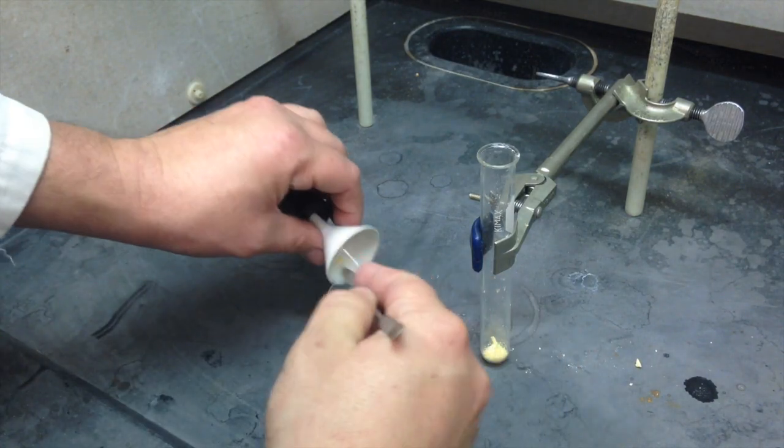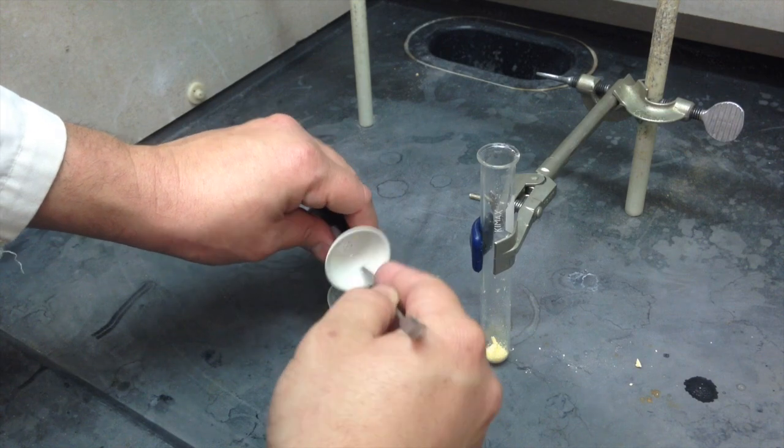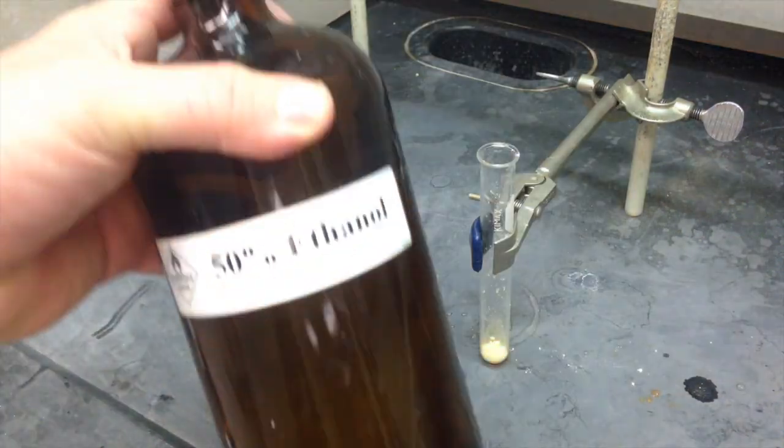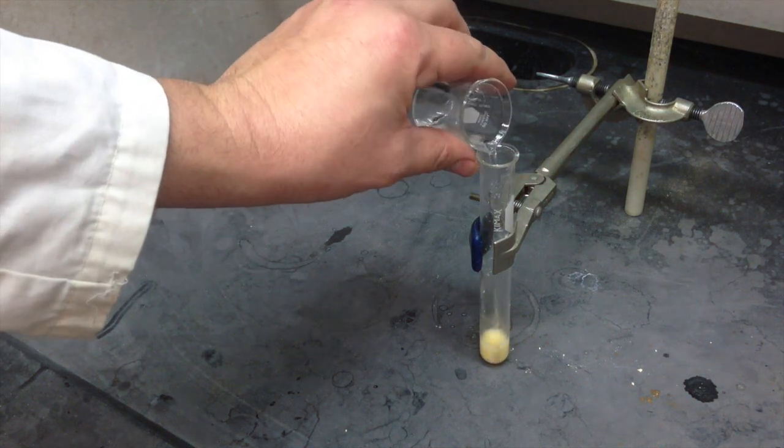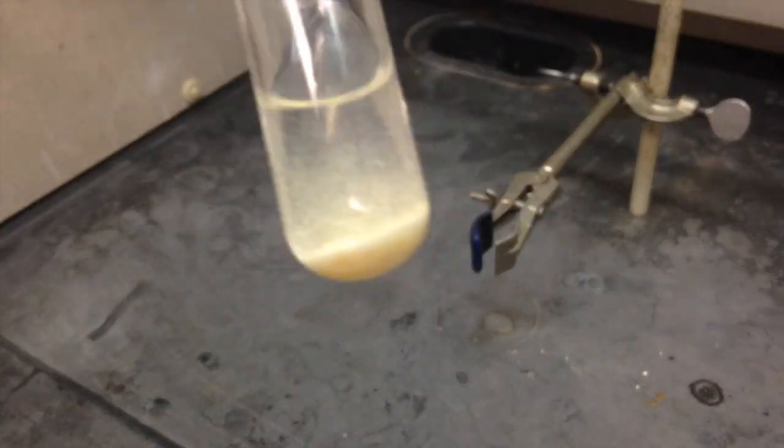To do this, we need to transfer this to a nice, new, clean test tube. I recommend transferring it to a weighing cup first. It makes your life a lot easier. We're going to do our recrystallization in hot 50% ethanol, 50% water. But it doesn't really dissolve it.